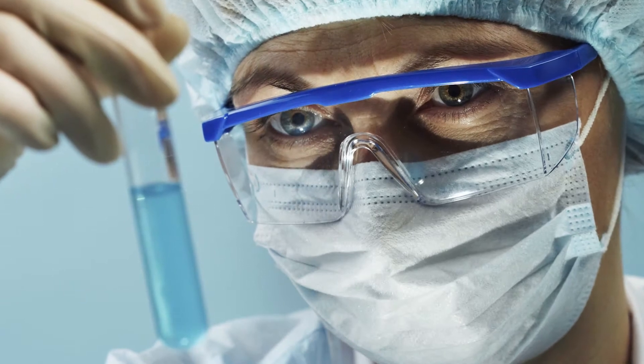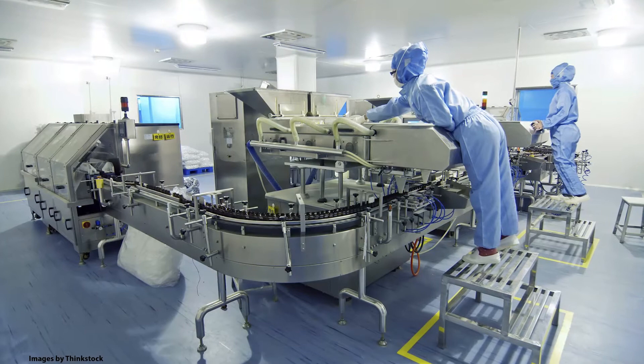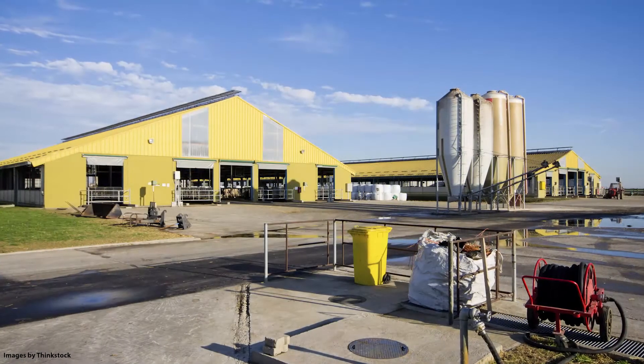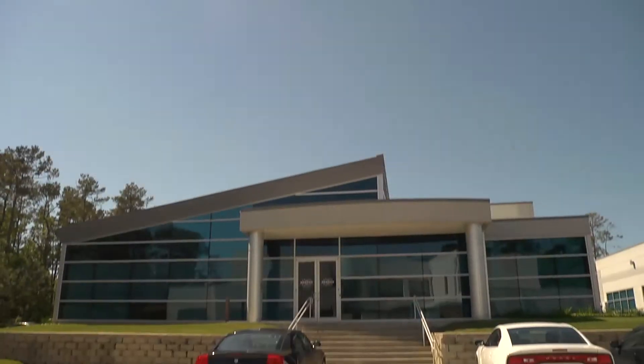FT-NIR spectroscopy is today well-established for quality control applications in all industries, including the pharmaceutical, food, agricultural, and chemical sector.